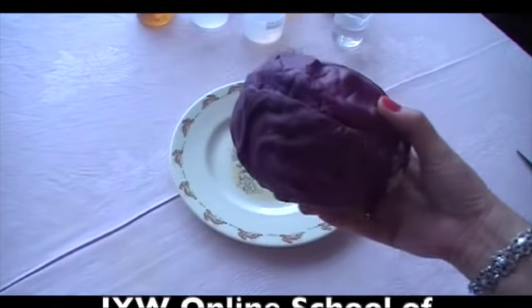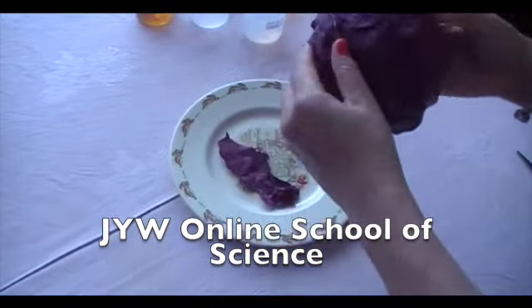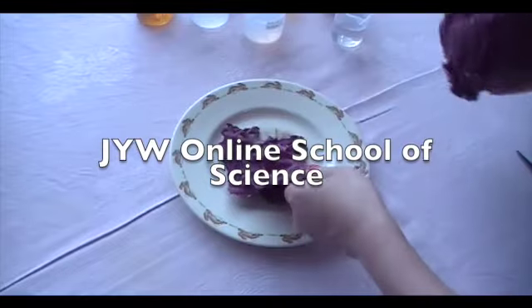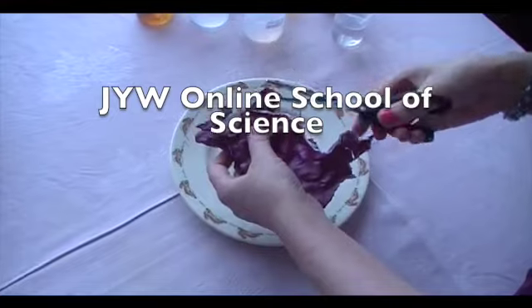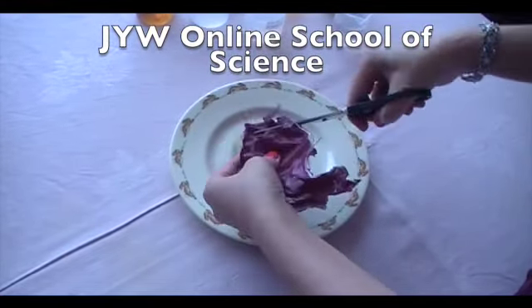What you do is you buy a red cabbage, and you peel it like that, and then you just cut it into smaller pieces. Using a pair of scissors, you can just cut into smaller bits like that.